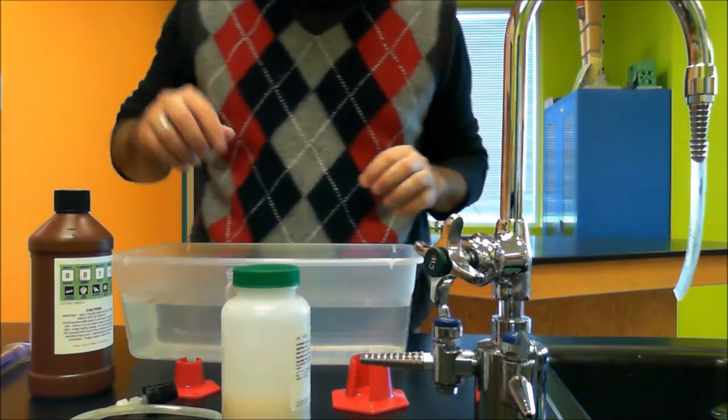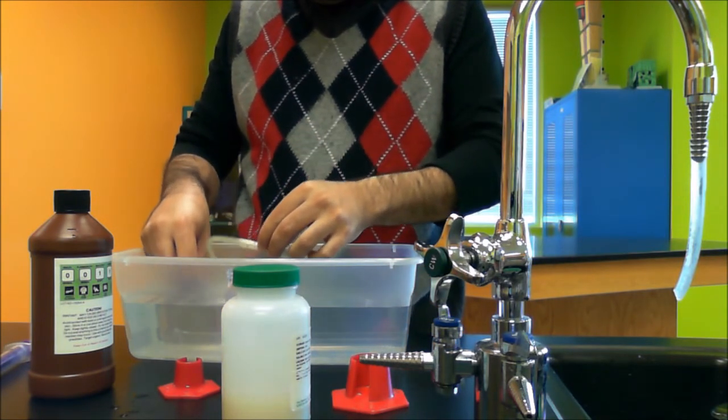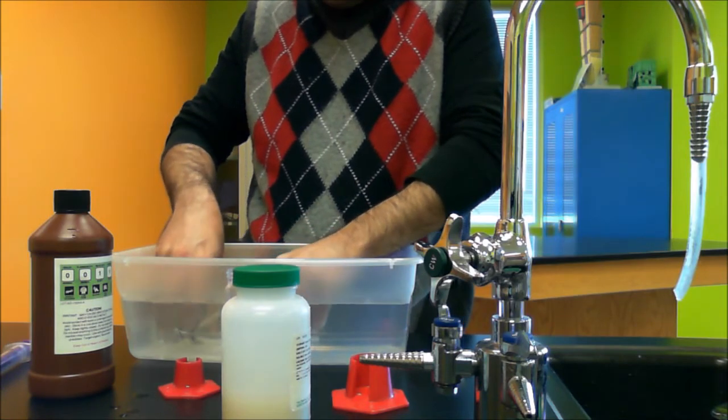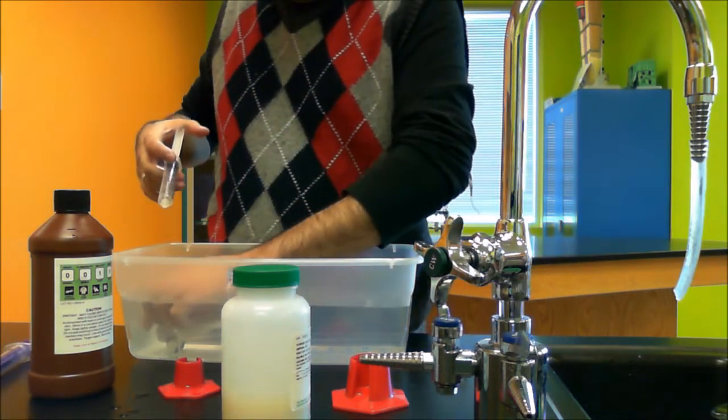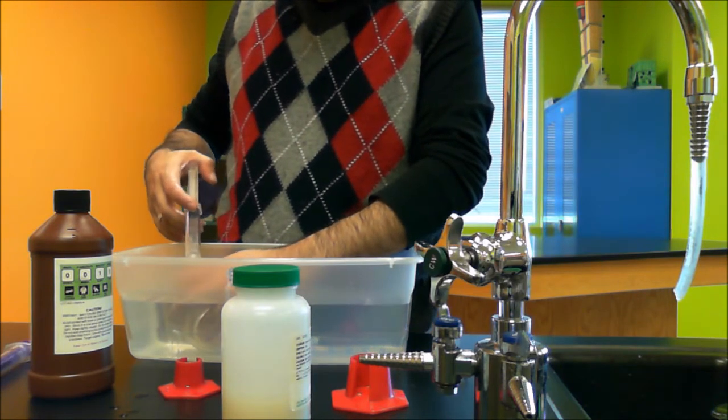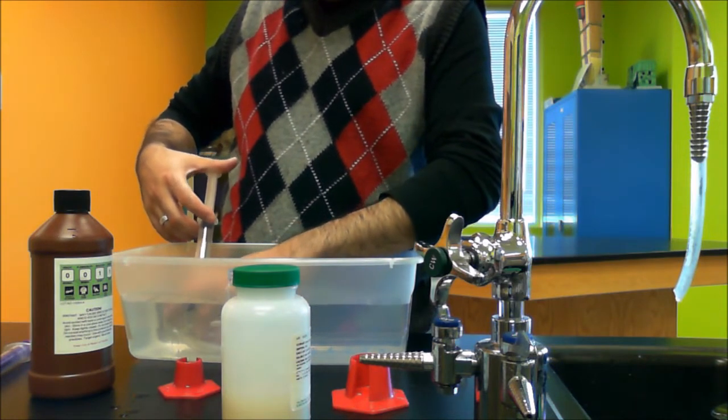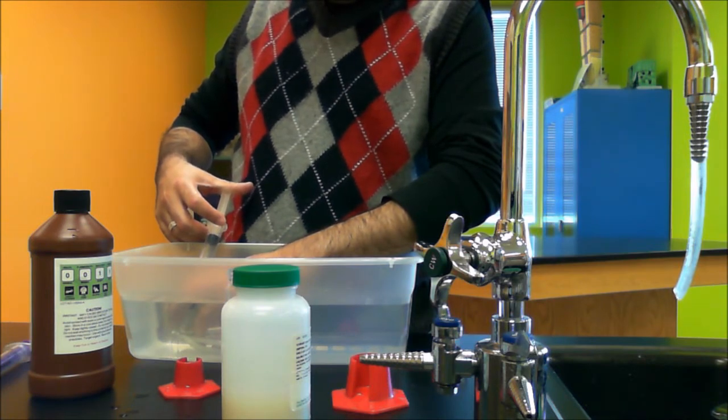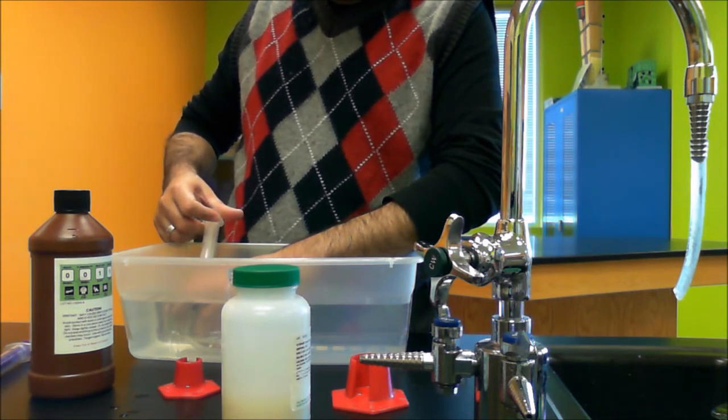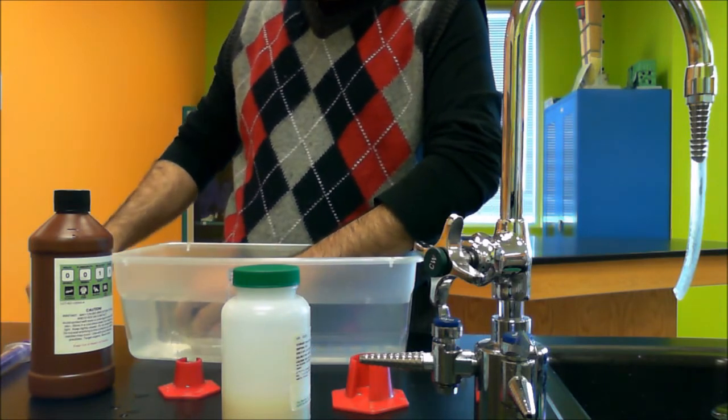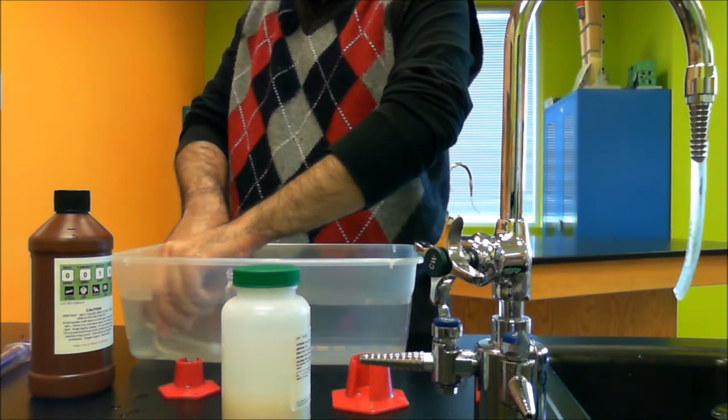So after you submerge your graduated cylinder, submerge your plastic tubing with your rubber stopper in it and using this syringe, inject air in your plastic tubing so there's no water remaining in the plastic tubing. Insert your plastic tubing in your graduated cylinder.